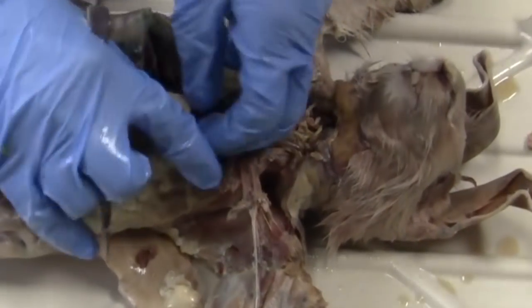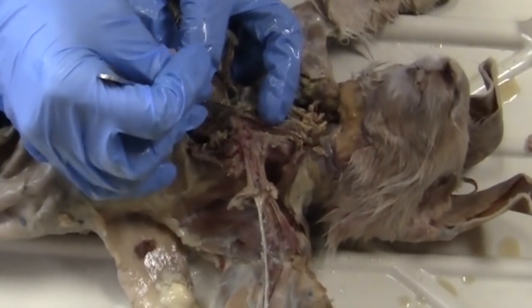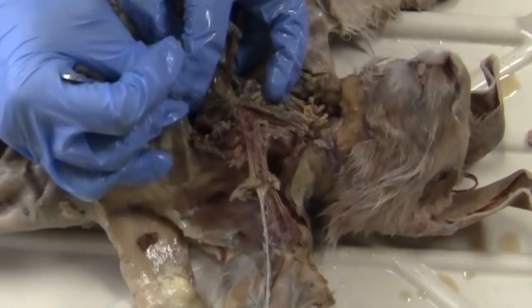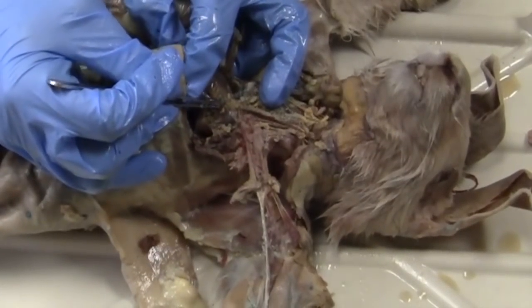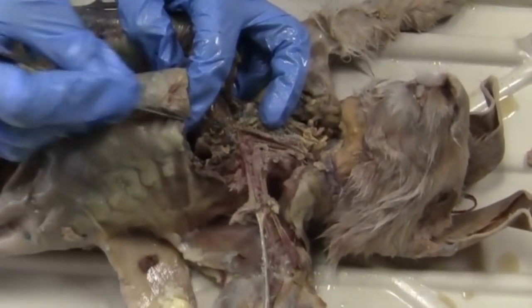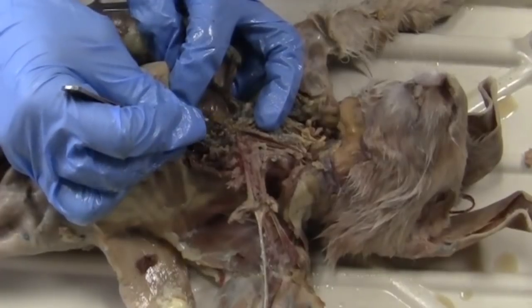So, this is the part, hopefully I cleaned it up enough that you can see it. And this is the part where we have a problem that my rabbit did not get dyed very well. So it's pretty hard because they're not red. So, coming out of the heart, coming out of that left ventricle, we have the aorta. The aorta is going to curve and go to the bottom half of the body. So, we have the aortic arch.